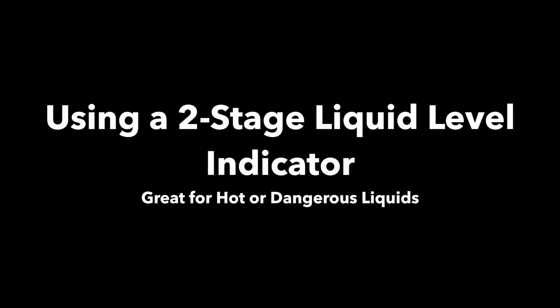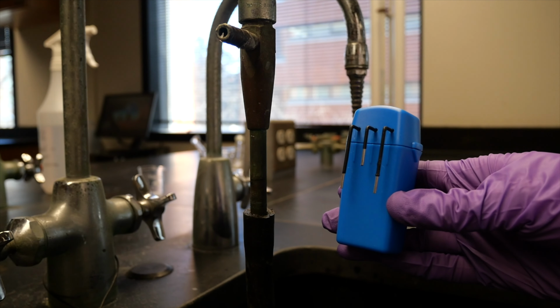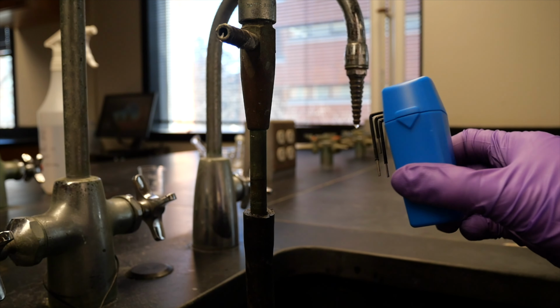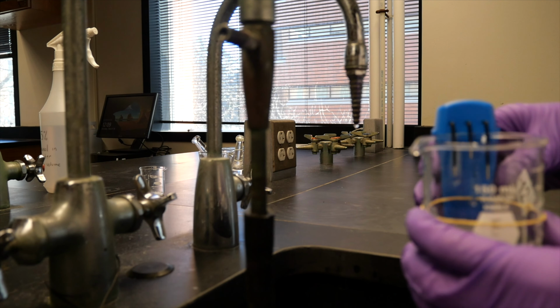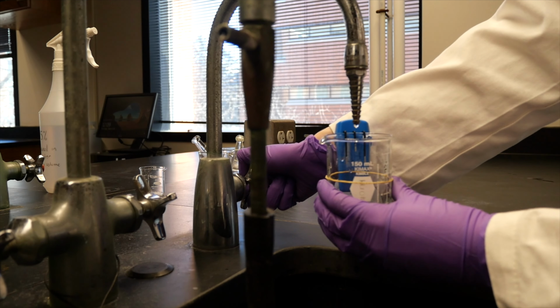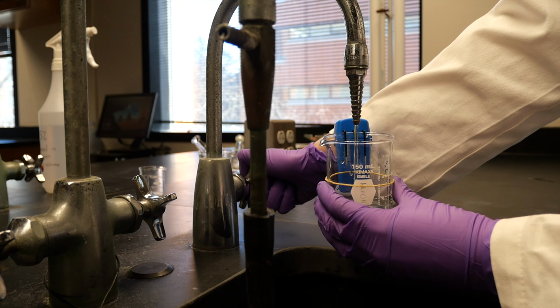Using a two-stage liquid level indicator, great for hot or dangerous liquids. This liquid level indicator is battery operated. There's two prongs that reach over the sides of the cup, and when those two prongs are in contact with the liquid, they will beep. There's a third prong above that, and it will beep faster when it hits that one.